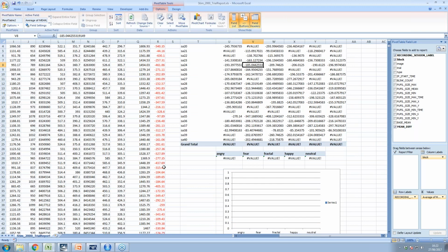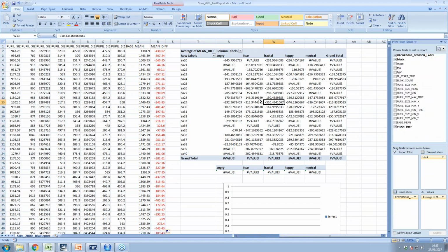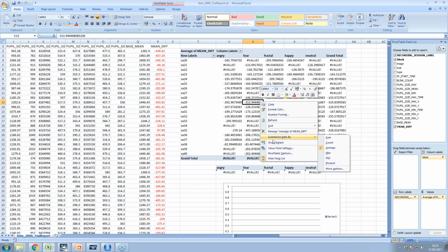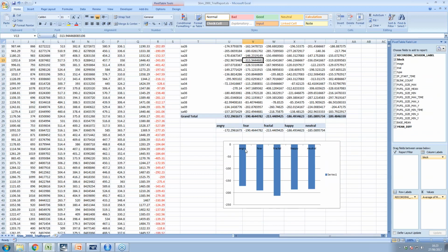It doesn't like that. And change it to IFERROR, and if we can't subtract it, then we'll just take I2. So that IFERROR function is quite useful. So basically I subtracted it if there was something to subtract from. If not, I just gave it the other one.